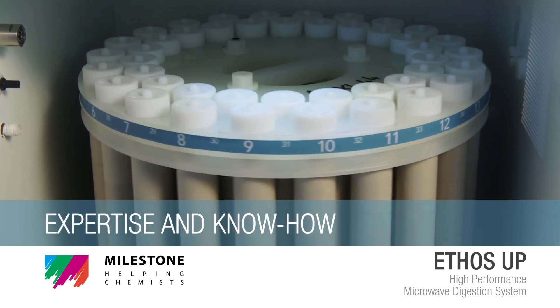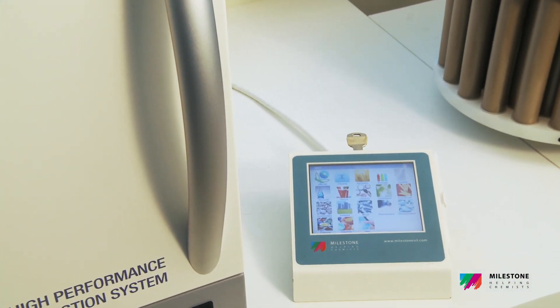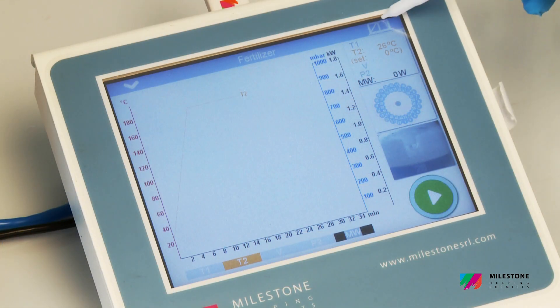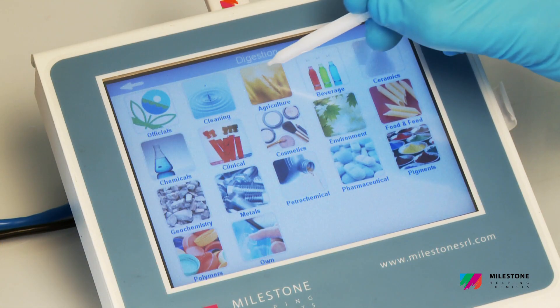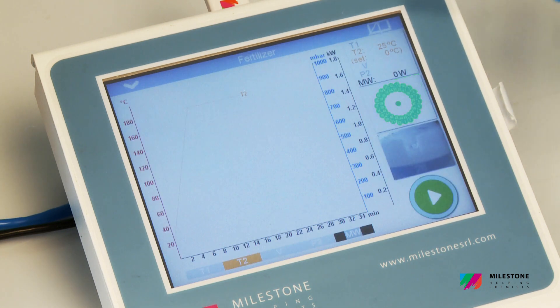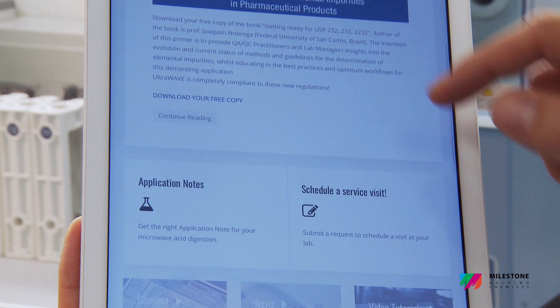Expertise and Know-how. The Ethos Up user interface fully controls all the digestion parameters, provides complete documentation and expedites the overall digestion procedure. Select one of the hundreds of preloaded methods, press start and the system will automatically follow the user-defined temperature profile using a sophisticated PID algorithm.